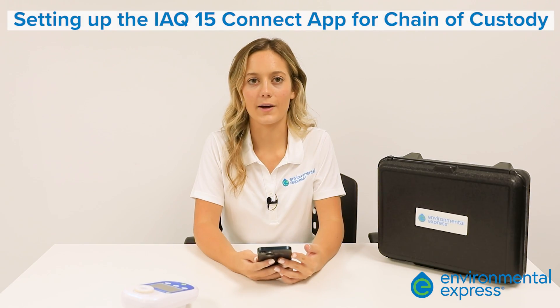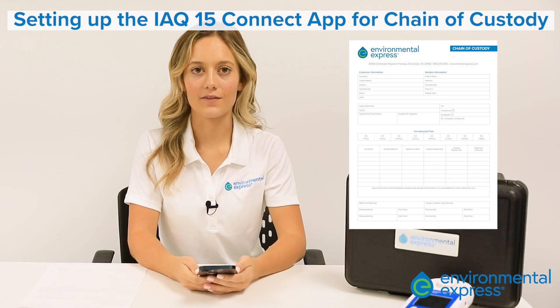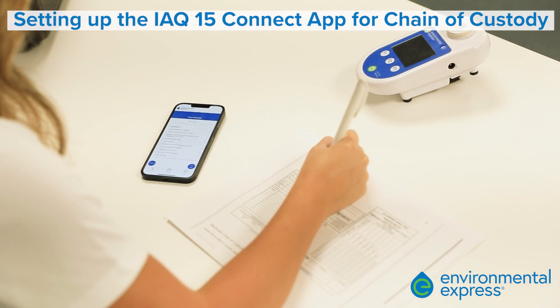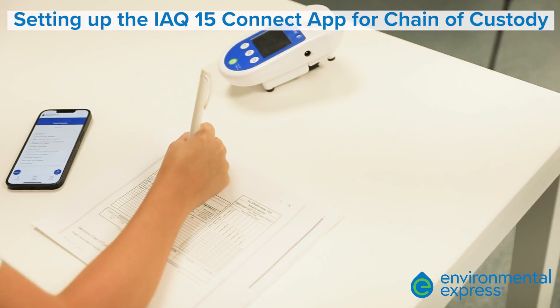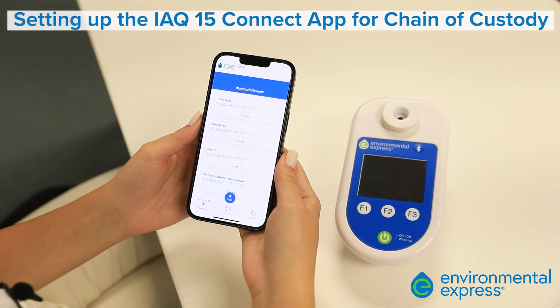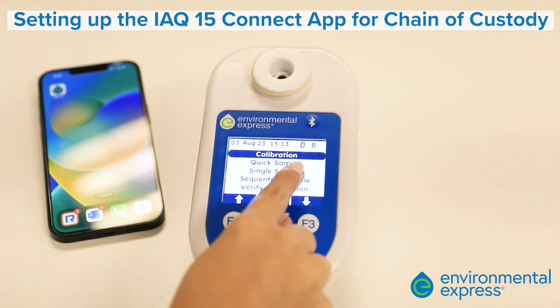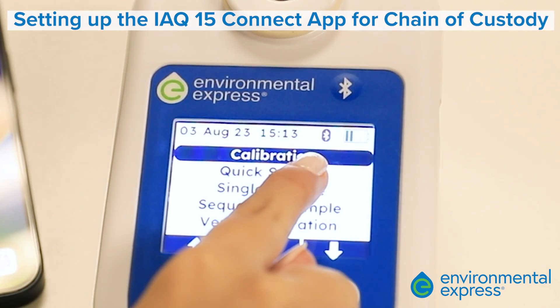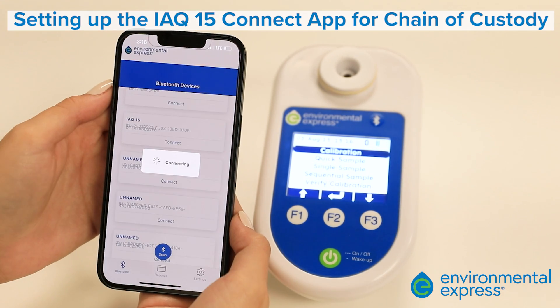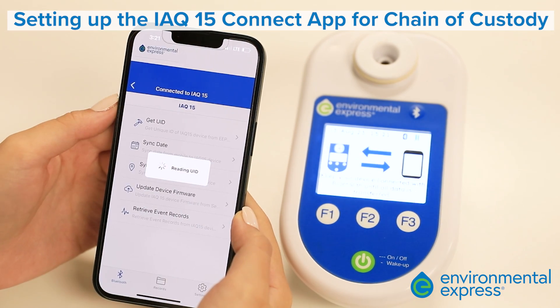One of the best things about the Total IAQ solution is our app for storing sampling information for chain of custody. Chain of custody information can be retrieved via the IAQ Connect app. Now you can retrieve sampling information without the sampling pump or technician being present. Download the app using the App Store or Google Play. To use this feature, we start by connecting our app to the pump. Press the Bluetooth button on the pump. A light will appear on the screen indicating it is ready for pairing. Open the IAQ app on your phone or device. Navigate to your pump's name, press the sync button on the mobile app, and select all the parameters you want stored on the mobile app.